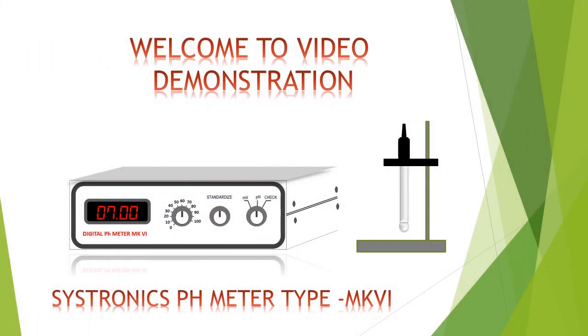Hello, welcome to demonstration videos of Sistronix instruments. Here I am demonstrating calibration and operating procedure of Sistronix pH meter type MK6.